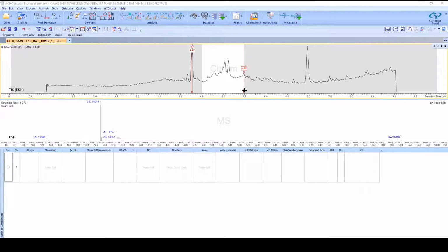If you're going to do just the mass search, then to separate the different components, you'd be using what we call IX2, which is IntelliExtract. And this is merged into our tool for doing the library searching. So we'll talk about that as I go into our IXCR tool.